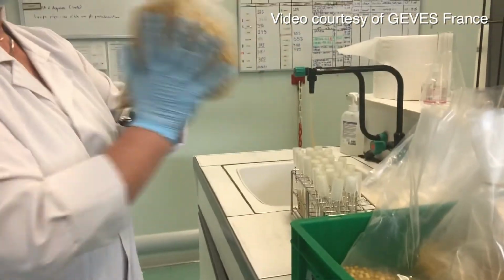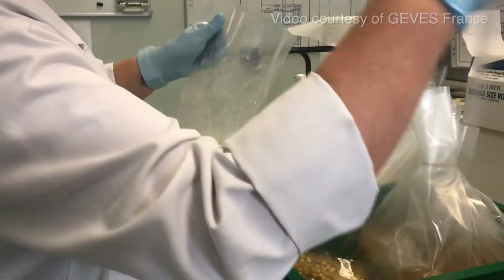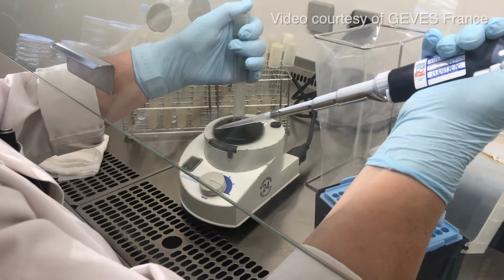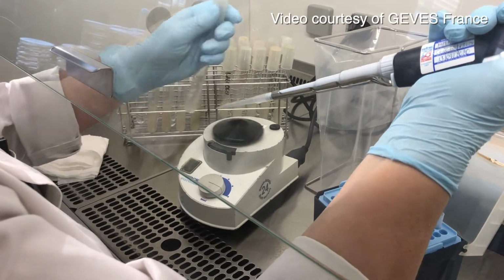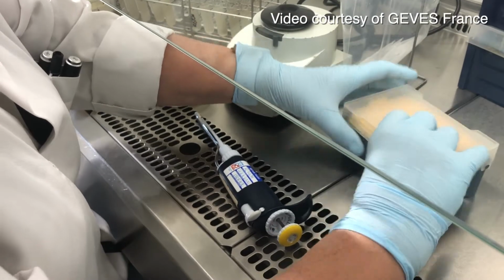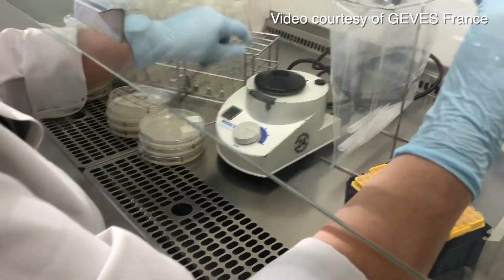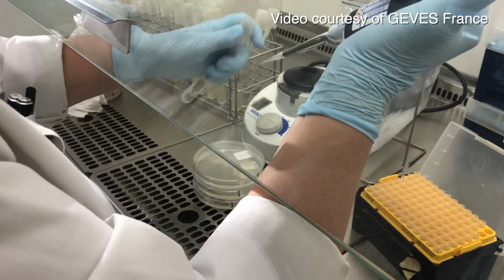I'm Valérie Grimault. I'm the head of the phytopathology laboratory of GEVES. I've been involved in ISHI for around 15 years, and now I'm a member of the method validation team. In fact, I was the project lead for this method with Rodolphe Germain, who is from Vilmorin. And first, we based it on a method with seed maceration, dilution plating on semi-selective media, morphological identification, and confirmation of suspect isolates by pathogenicity tests.